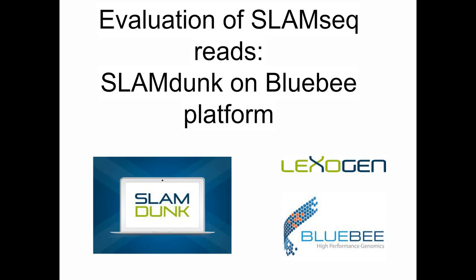Okay, and this next one is for you too. Can SLAMseq be used to quantify non-coding RNAs? So this goes in a similar direction. Again, if one has a proper sequencing strategy, so library preparation protocol, and this involves a reverse transcription step, then yes, it should be compatible with quantifying non-coding RNAs.